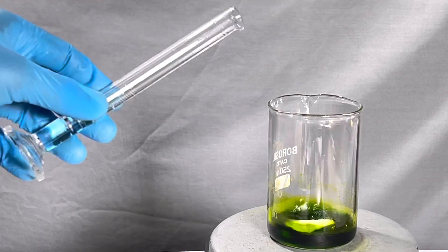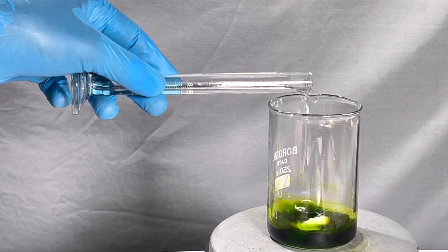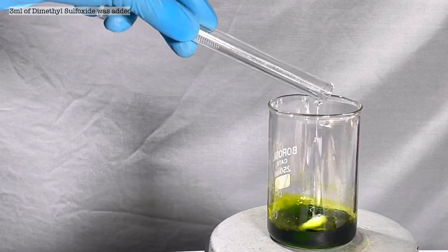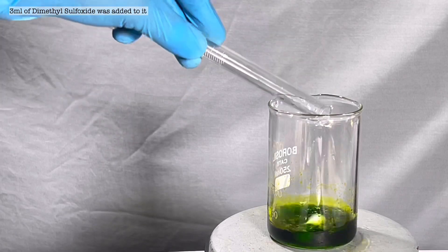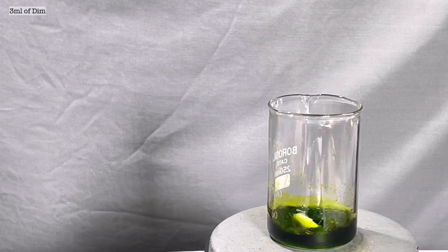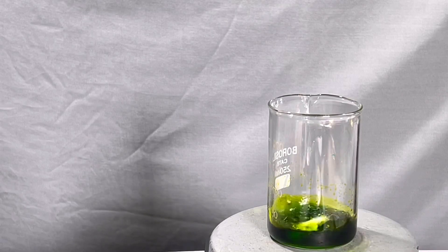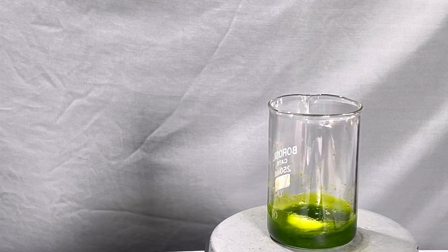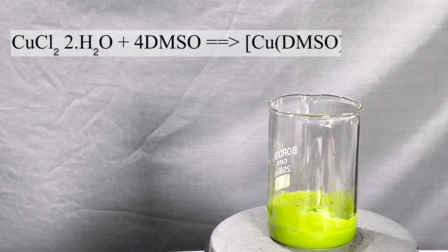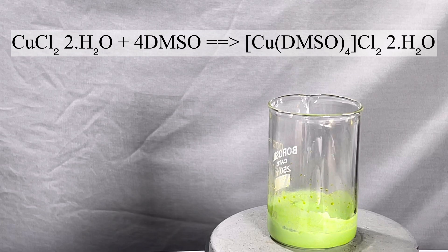Now 3 milliliters of DMSO was added all at once to the copper chloride solution. Initially you don't notice anything, but by around 30 seconds a light green precipitate crashes out, making the stirring bar almost impossible to stir. Here the copper complex with DMSO has formed.